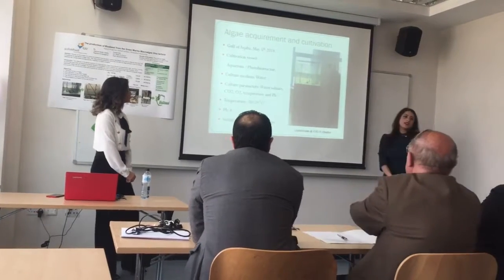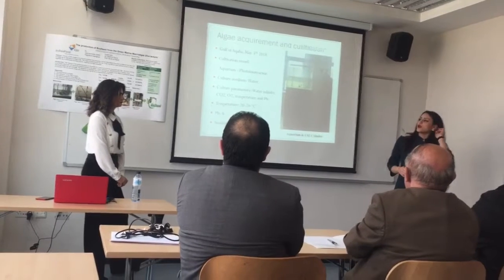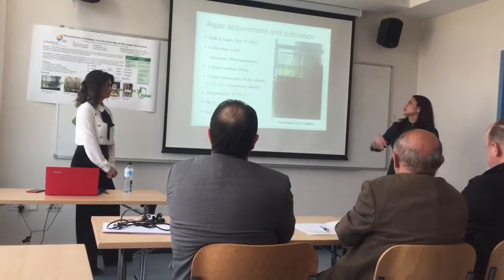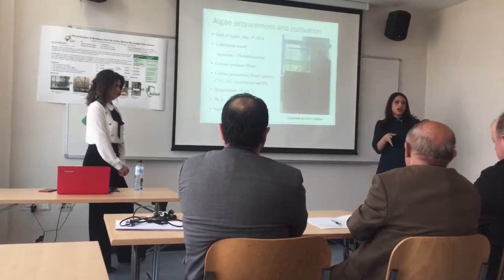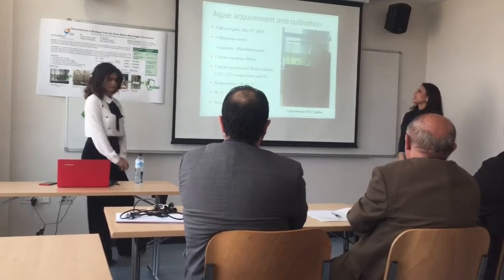First, we acquired the algae from Aqaba on May 5th, 2018. This was around a year ago. After we got the algae, we had to transfer it to a cultivation vessel, which is the aquarium, also known as the photobioreactor. A photobioreactor is a reactor that allows photosynthetic organisms to grow.